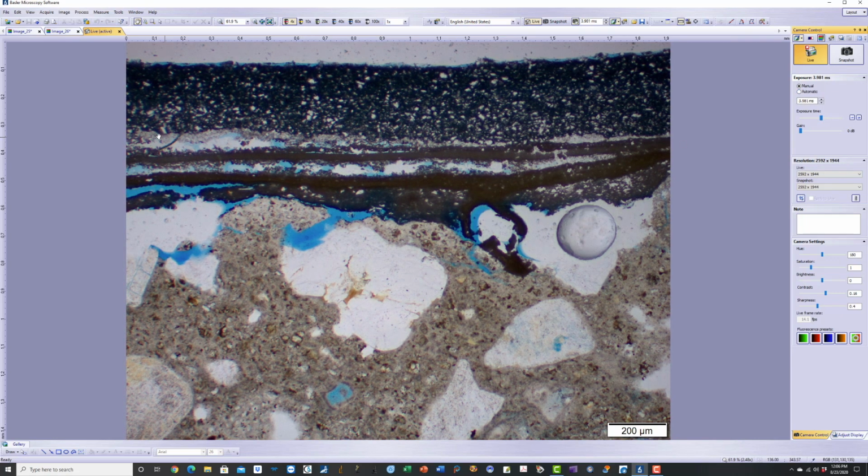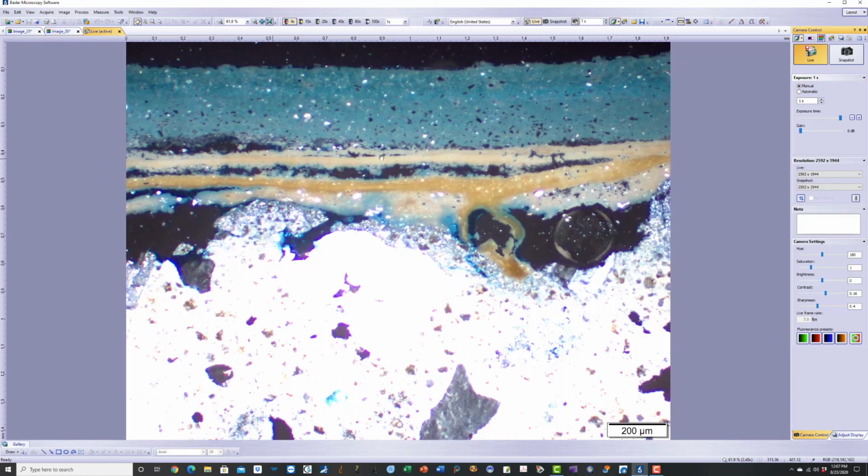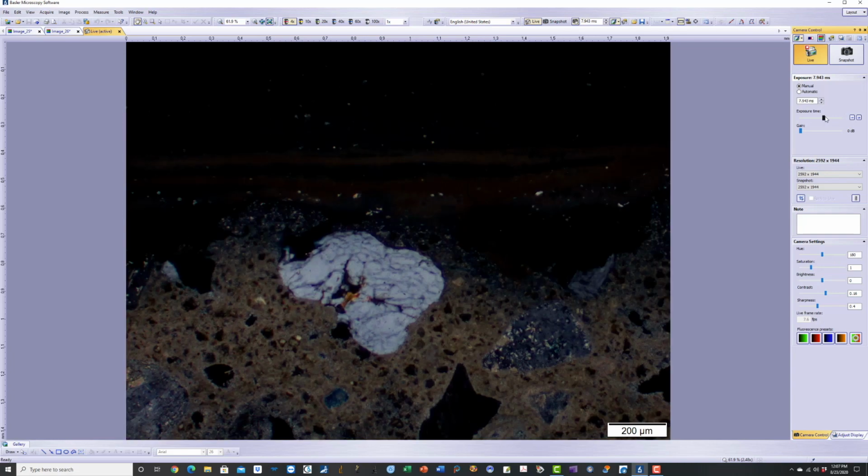Here you can see there is a thin cementitious layer in the middle between the top acrylic layer and then the intermediate acrylic layer, then the bottom acrylic layer. So you have multiple applications of acrylic layers, a paint layer with interstitial layers of cementitious materials, which has been, if you go back again, let's reduce the exposure, which has been carbonated. This is the cementitious layer in between the paint layer, which has been carbonated.